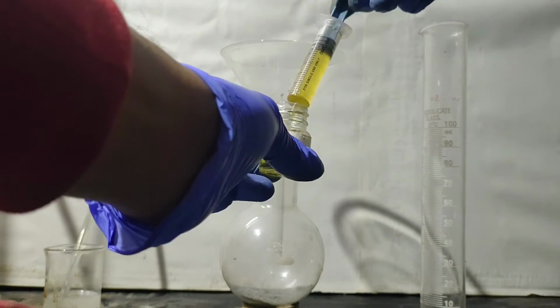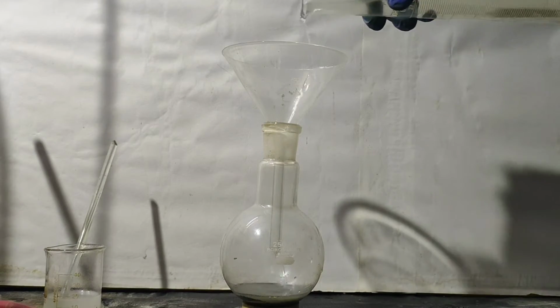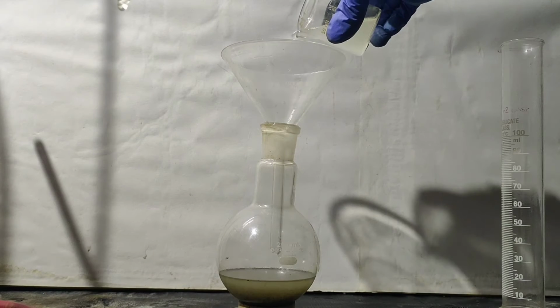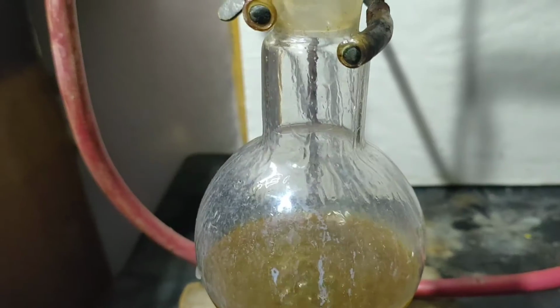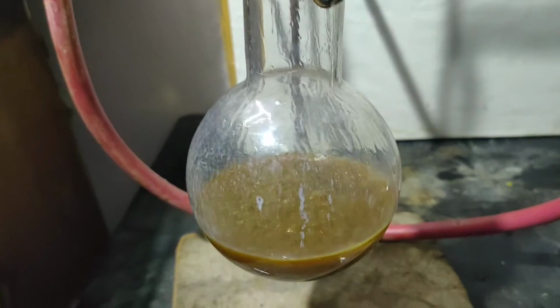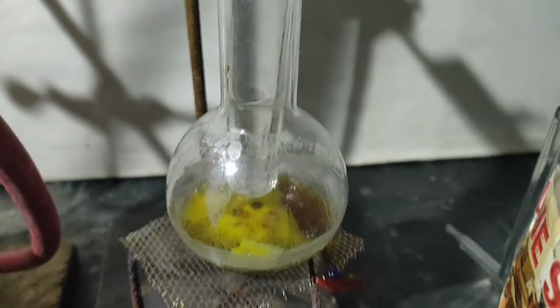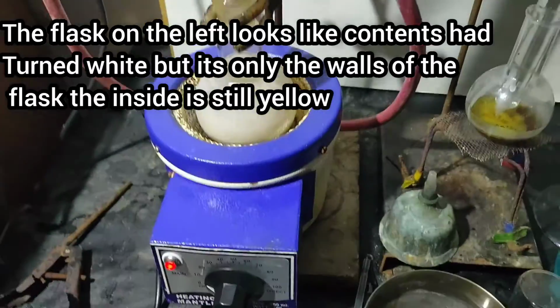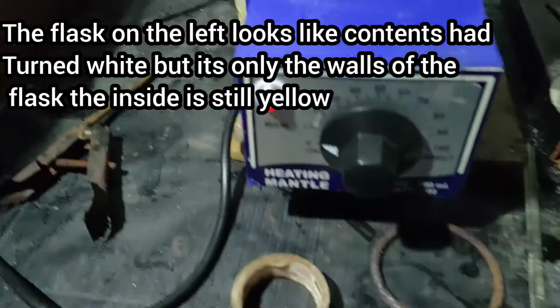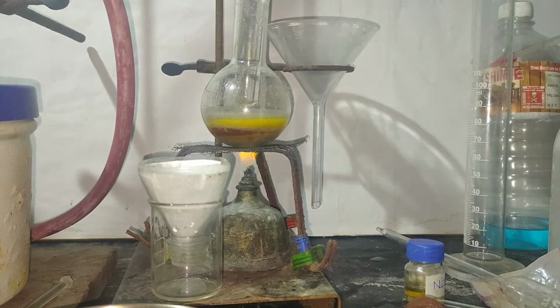So I tried once again with freshly powdered zinc and replaced the methanol with ethanol. When I added the sodium hydroxide solution, this time the reaction became vigorous and the ethanol itself started boiling. When boiling stopped, I heated it on a water bath. Meanwhile, in a 100 ml flask, I scaled the reaction to a 1 ml nitrobenzene scale and replaced the zinc with more reactive aluminium. For reflux, I filled a test tube with water and immersed it in the flask.